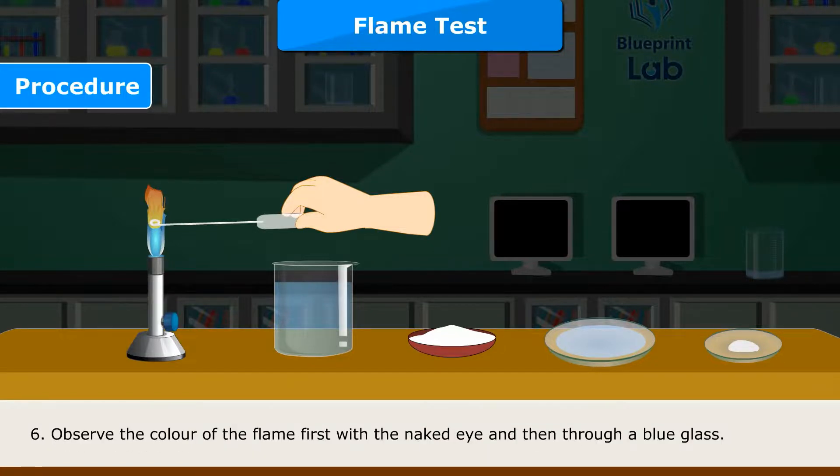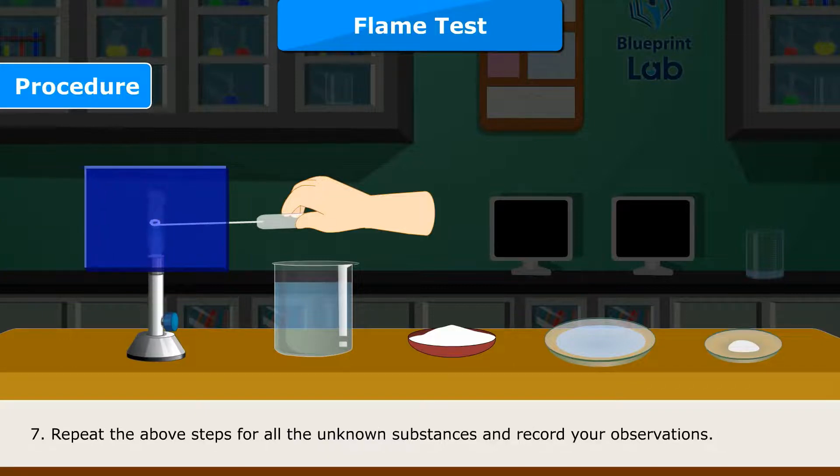Step 6: Observe the color of the flame, first with the naked eye and then through a blue glass. Step 7: Repeat the above steps for all the unknown substances and record your observations.